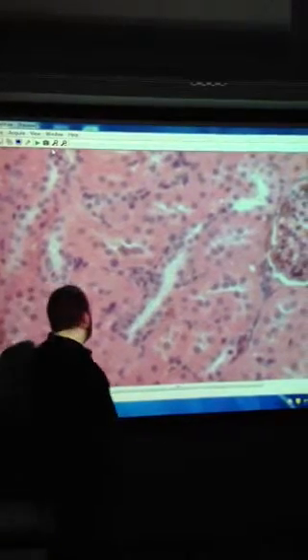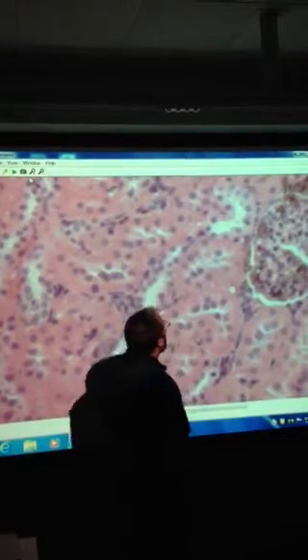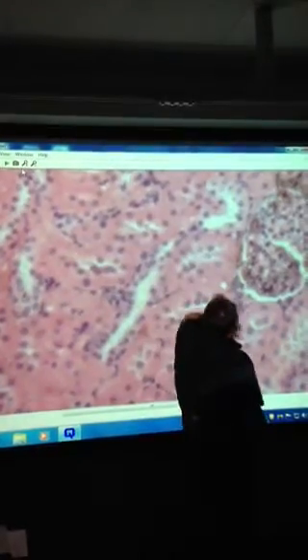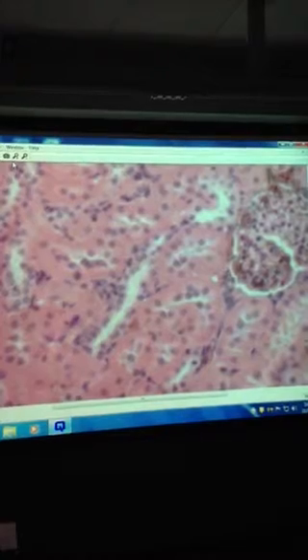Oh, wait a second. No, these might be epithelia. So. Yeah. I think you're right. So these would be proximal convoluted tubules. Yeah. I think these are distal. That's tricky. I would give you a really clear example with the answer. I would know.